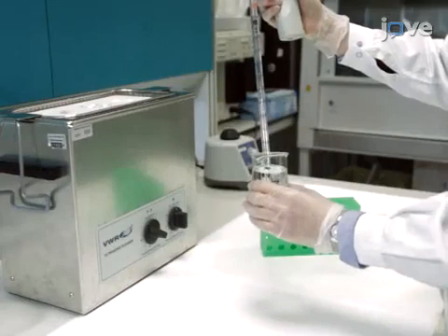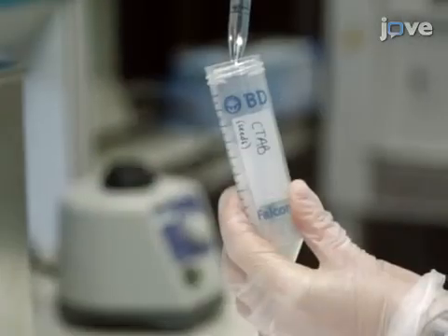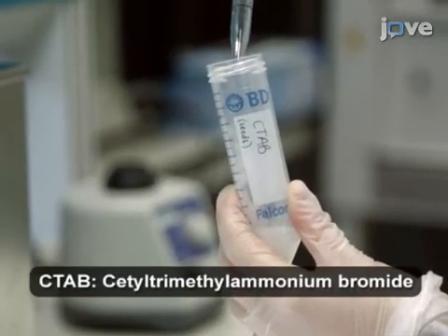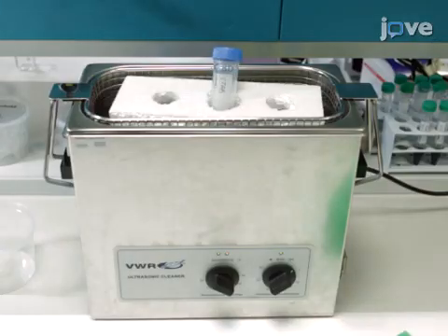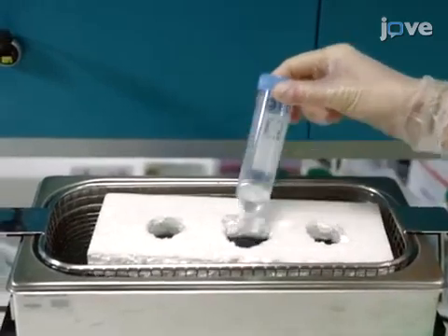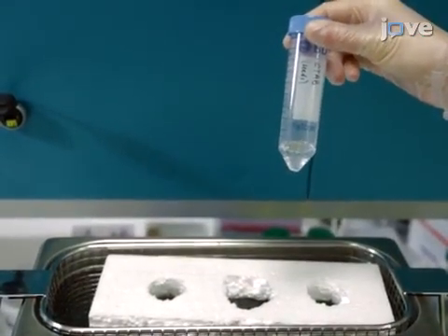To begin preparation of the gold seeds, first dissolve 364.4 milligrams of CTAB in 5 milliliters of water at 40 degrees Celsius using ultrasonication. Remove the sample from the sonicator once the solution becomes clear and allow it to cool to room temperature before proceeding.